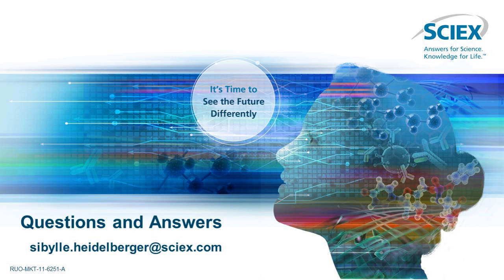Right. So MAM stands for multi-attribute methodology. And what this is actually looking at is if you've already characterized your product and you're actually looking for specific either low-level or high-level attributes that you need to monitor, this is a way of actually using the mass spec to monitor them.